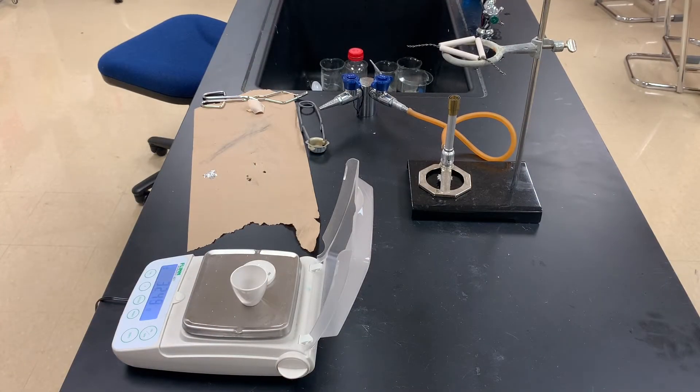I've heated my crucible up and gotten it all nice and clean and sterilized. I've placed it on the balance and the mass that we're getting as the mass of the crucible and lid is 32.48 grams. So go ahead and record that in your data table.